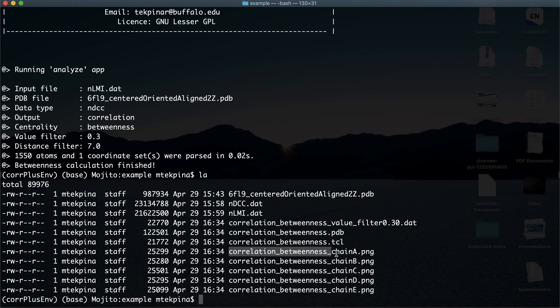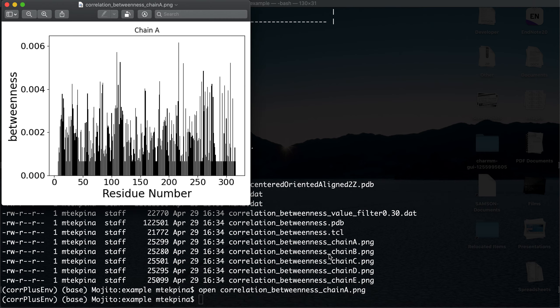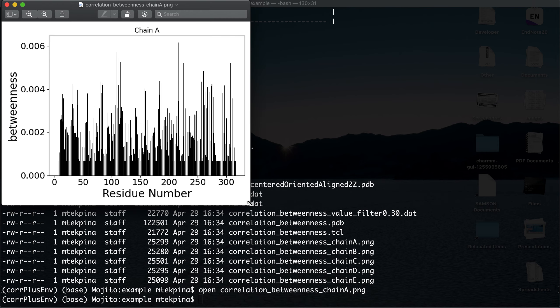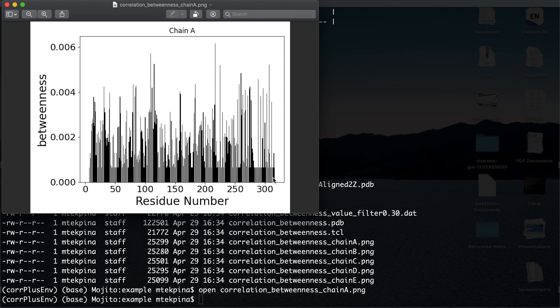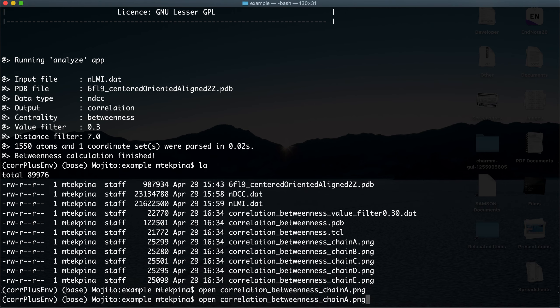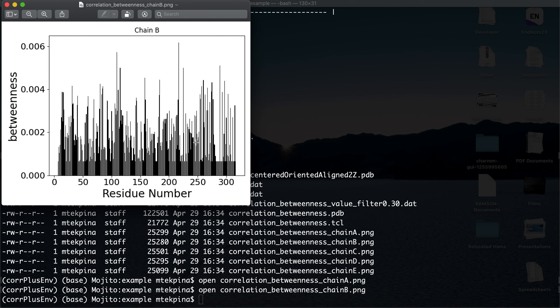It calculated betweenness for all chains separately: chain A, chain B, chain C, chain D, and chain E. In my case it was a pentameric structure. Let's open one of the output files — it plots betweenness for each residue and shows which residues have high betweenness in each chain.